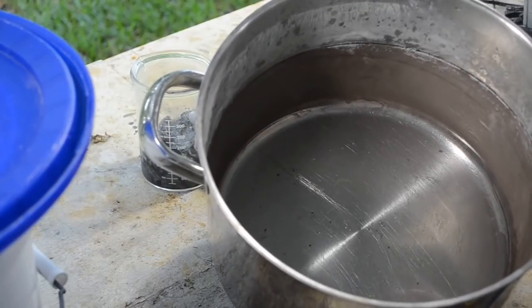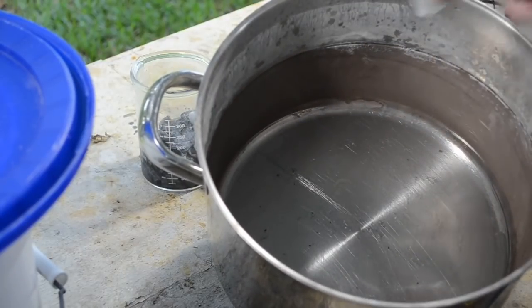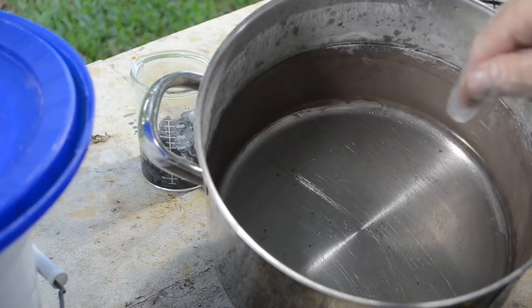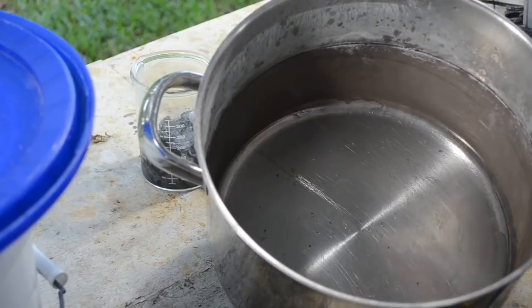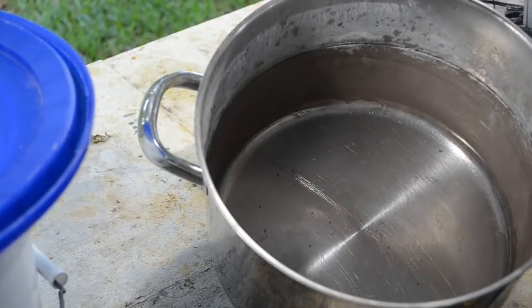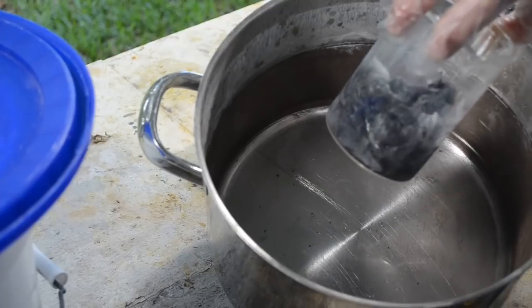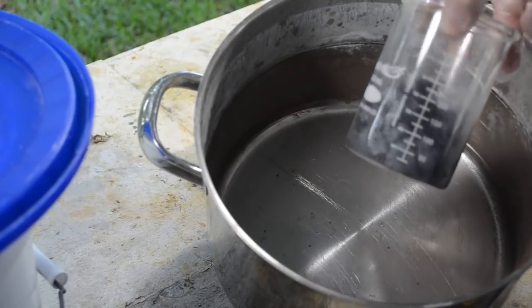So what I had to do was scrub it with a piece of paper towel, a couple pieces of paper towel actually. In fact, I had to resort to using a little bit of my dilute sulfuric acid mixture to break the bond of the zinc with the bottom, and then it all came right off pretty easy. This beaker right here contains the paper towels I was using. See all that black stuff? That's all cement gold.